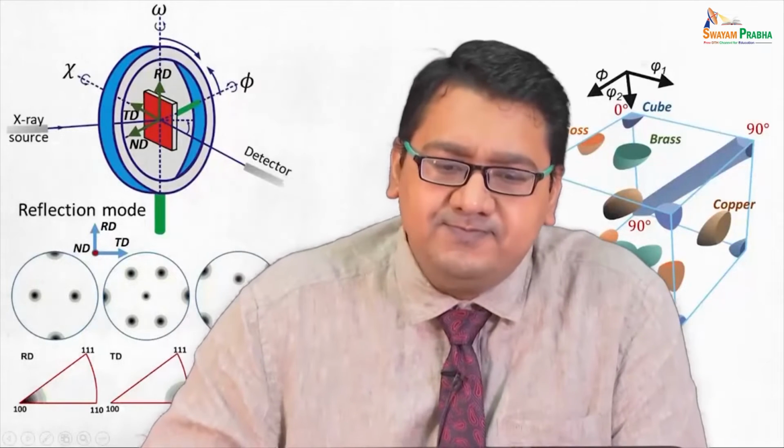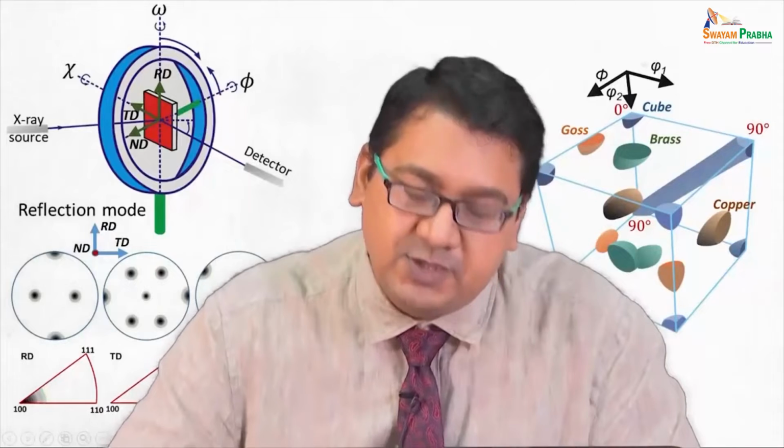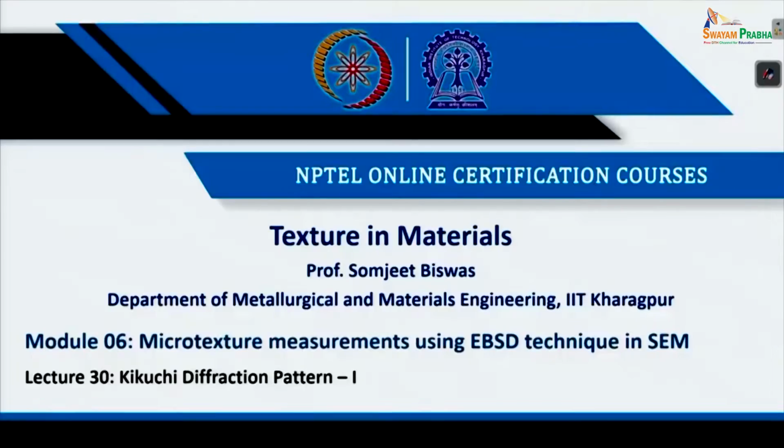Good afternoon everyone, and today we will be continuing with module 6, which is micro texture measurement using electron backscatter diffraction technique in a scanning electron microscope, that is SEM. So, this is lecture number 30, in which we will understand Kikuchi diffraction pattern, and this is part 1.